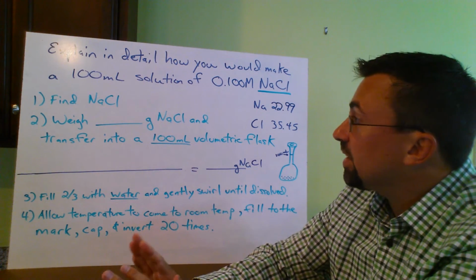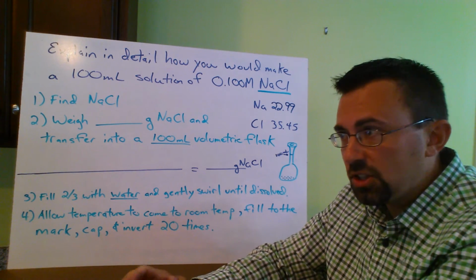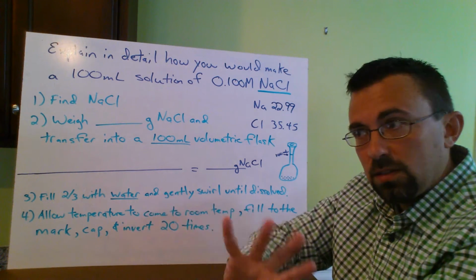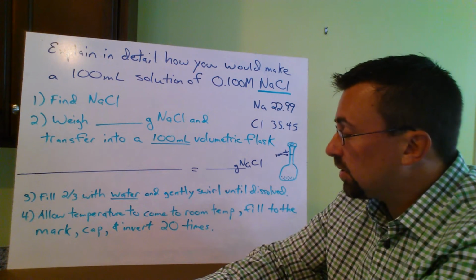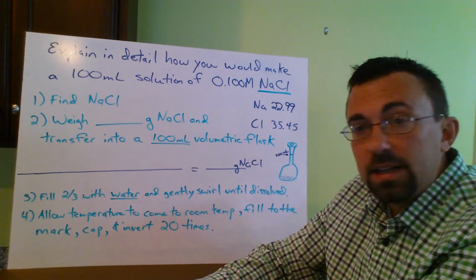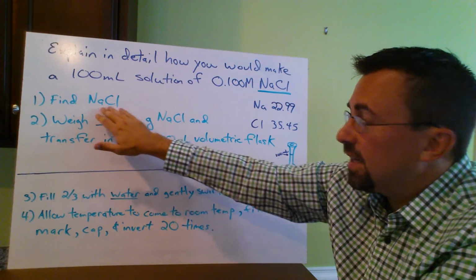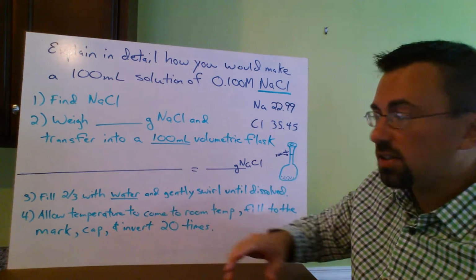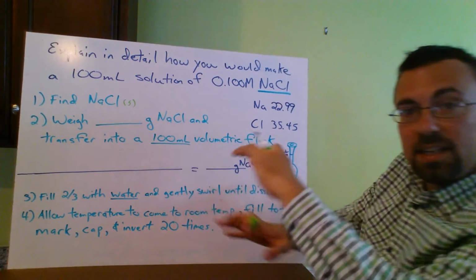So we have to find sodium chloride. If I were to look for this, I'm going to look for it on a shelf, in a bottle, in a spot labeled with sodium ions, chloride ions, or ionic compounds. How do I know? Well, that's an ionic compound. And how do I know ionic compounds are going to be in a jar and they're going to be solid? Because it's a really strong bond. We talked about that. Lots of ions piling up.